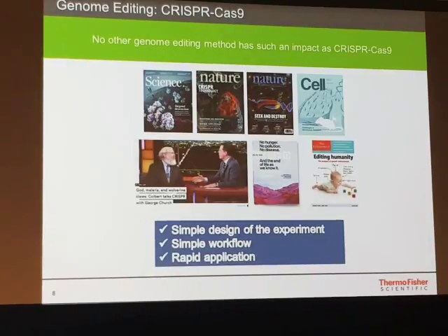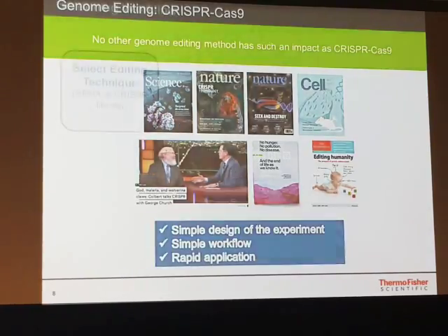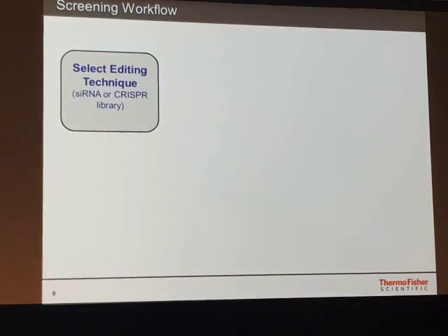Because CRISPR is changing the world, right? Everyone is talking about it, and it's a very powerful technique. But also, you have to somehow analyze your data, or maybe your images. And with that, I want to go through a little bit of a screening workflow, how we envision it at Thermo Fisher, and where we can help you.